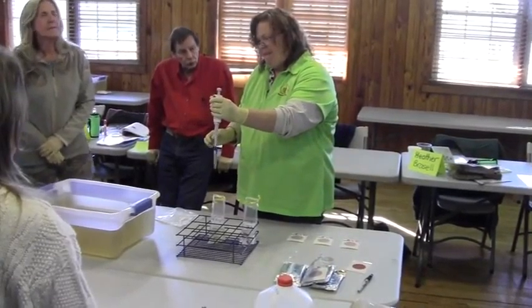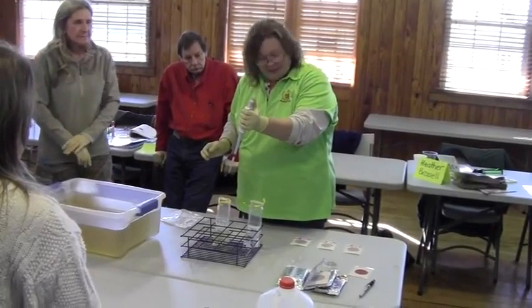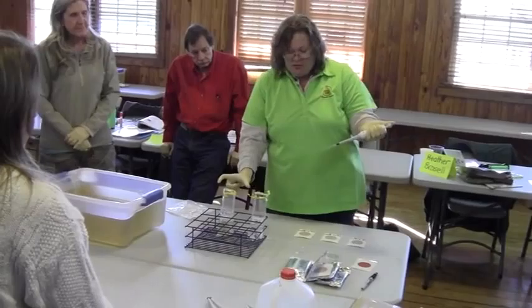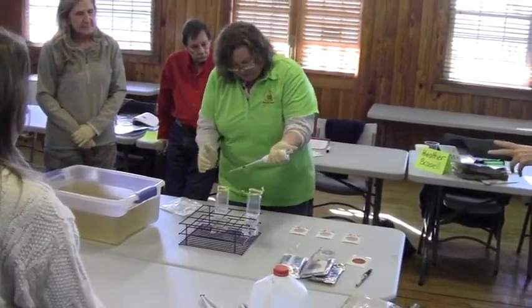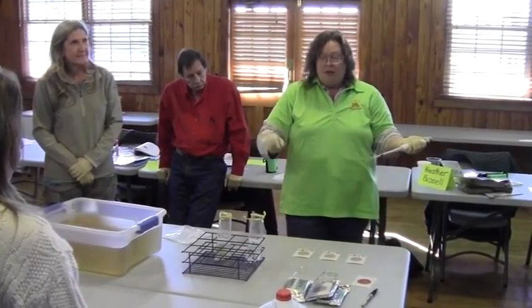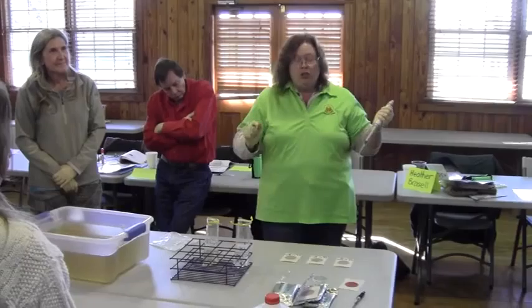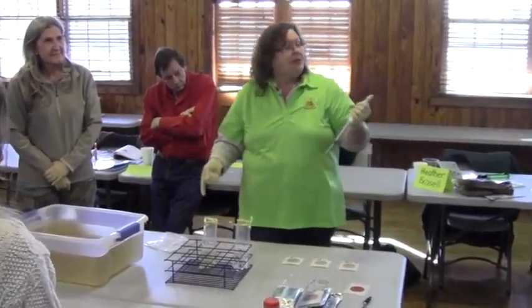So you can use the same tip and push it down first? Yes. You can use the same with this group — the control group and the next three samples. And then when you get ready to move on to the next sample, that goes in the garbage and you start all over again, because you don't want to cross-contaminate one sample site from another sample site.